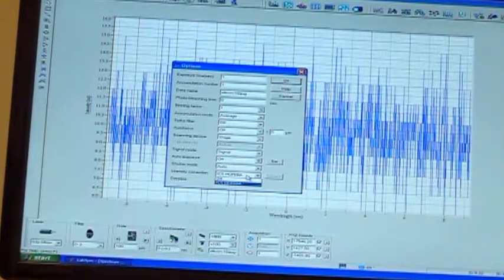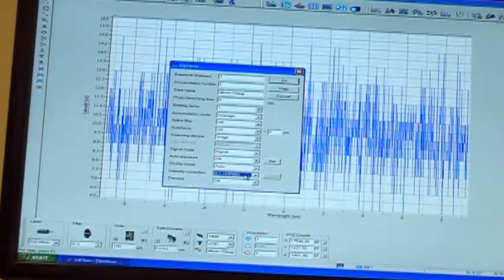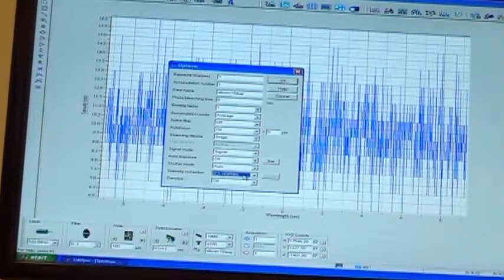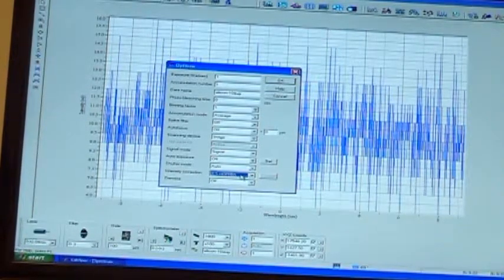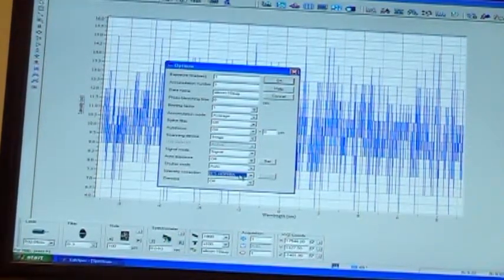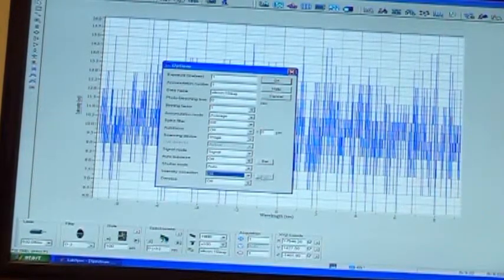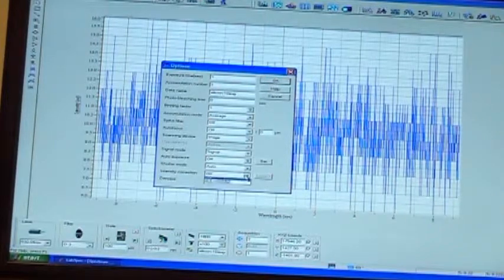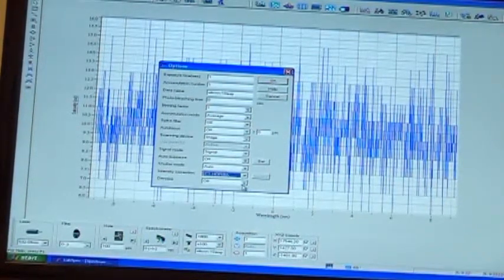But we have an ICS correction: they've already done a test on this in France, measured this little wave, and saved the file, so this wave is always subtracted out of your data. If for some reason this is turned off, you can manually correct it later, but we always recommend you just leave this on.